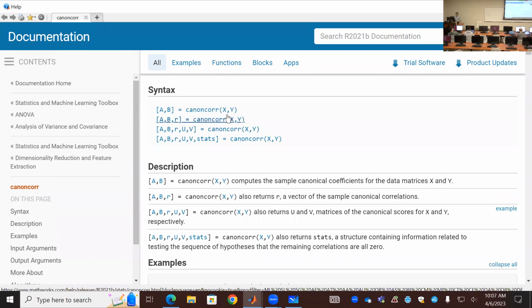So the idea is you have two inputs, two matrices. They are from different samples, measured in different ways, but you believe there's some internal, unspoken or latent alignment. So you want to find this alignment.